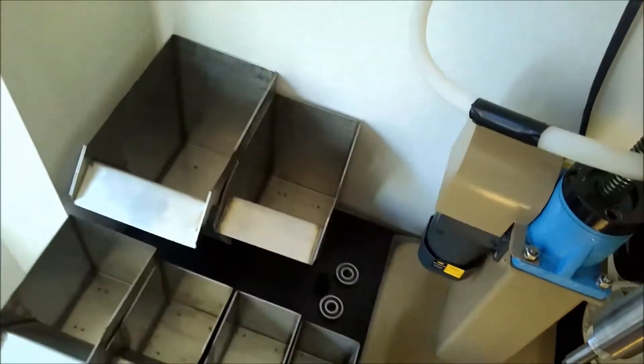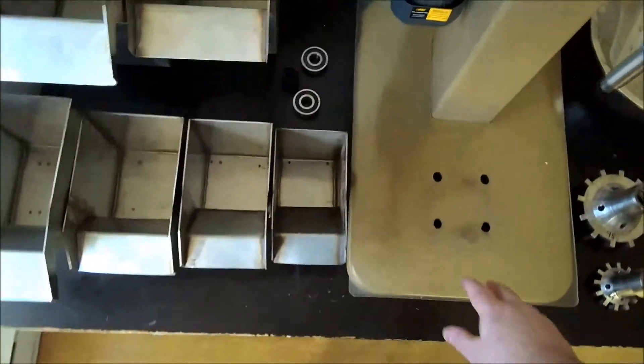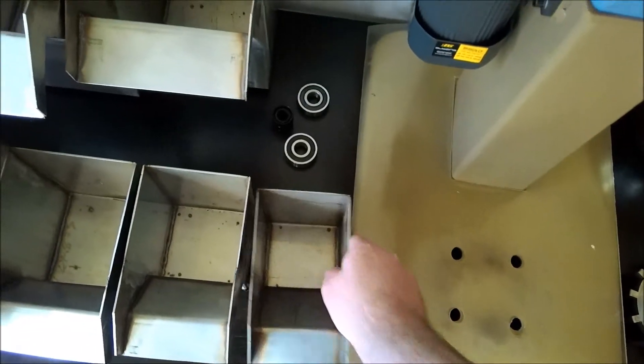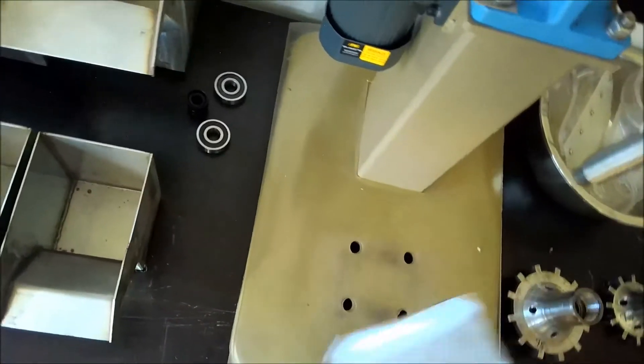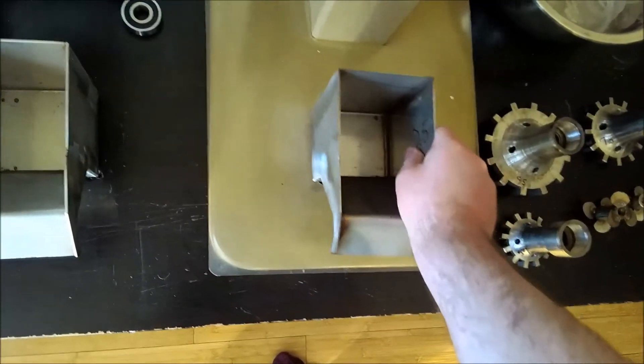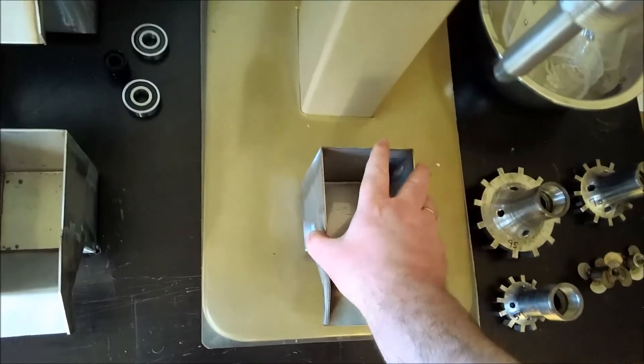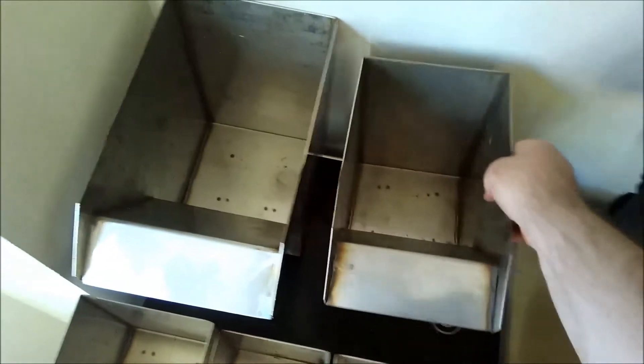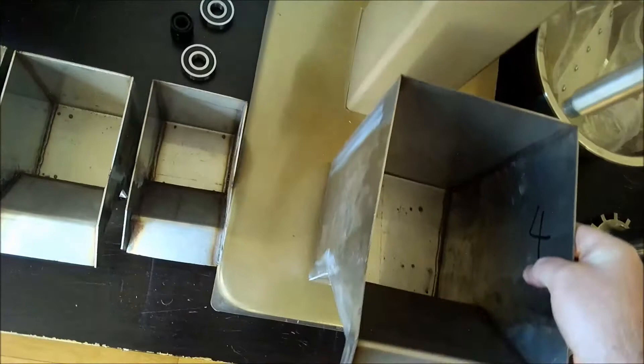The tank assembly is different than the original. Instead of a hole in which the tank sits, it's got four legs on each tank and it sits in there nice and snug. Okay, the bigger one, same story.